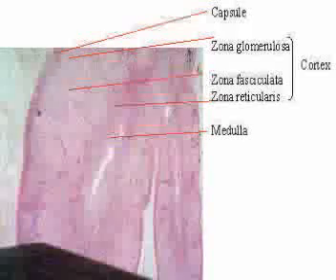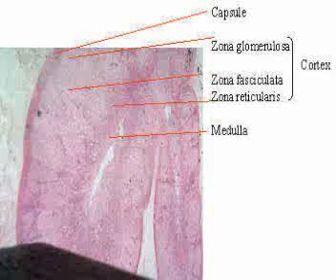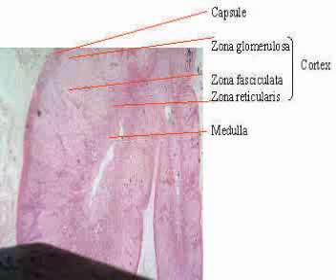The differential diagnosis of the adrenal gland is as follows. It can be confused with all other compact glands that have no lumen. It is easily confused with the pituitary gland or any of the lymphatic organs, but its characteristic zonulation is very prominent.